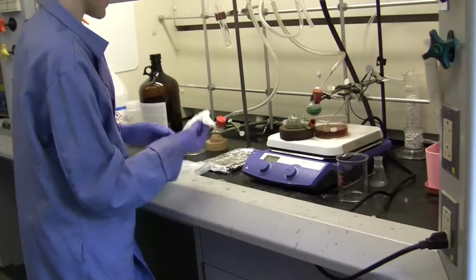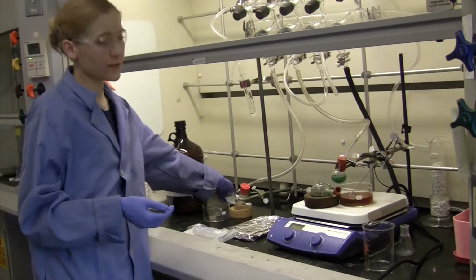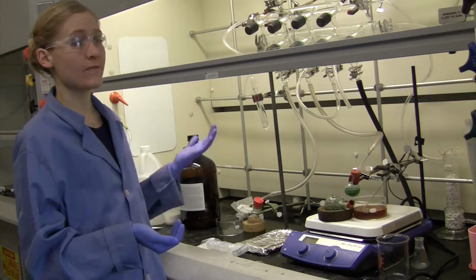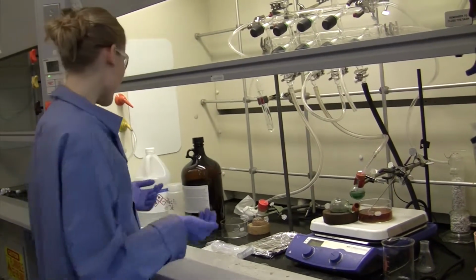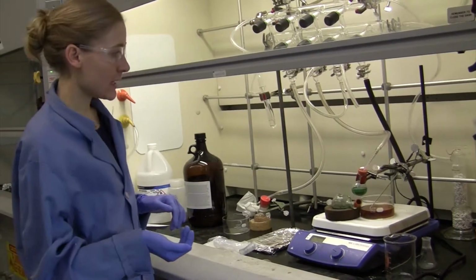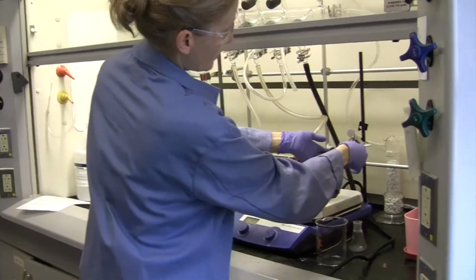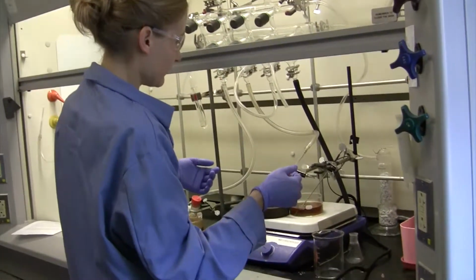Oh, no harm done. Rather than putting this in the wastebasket right away, leave it in your hood for a little bit because there are those chloroform vapors and you want them to evaporate. And if we put them just in the trash, they'd evaporate into the air we're breathing. Okay. So in the meantime, while that's stirring, we are going to set up our column.